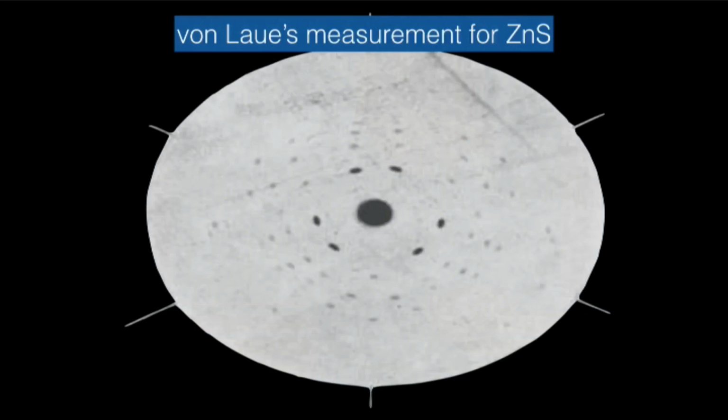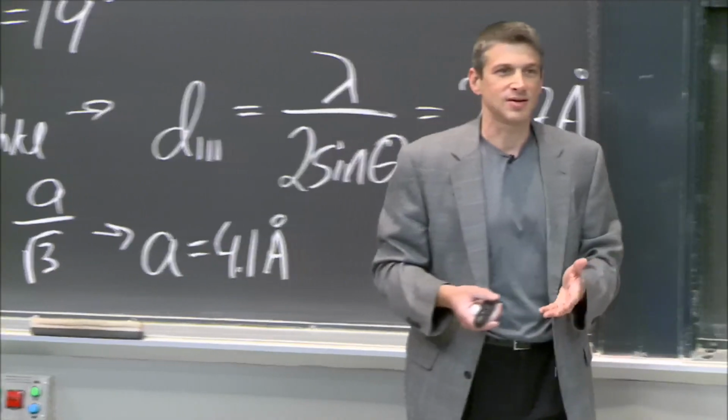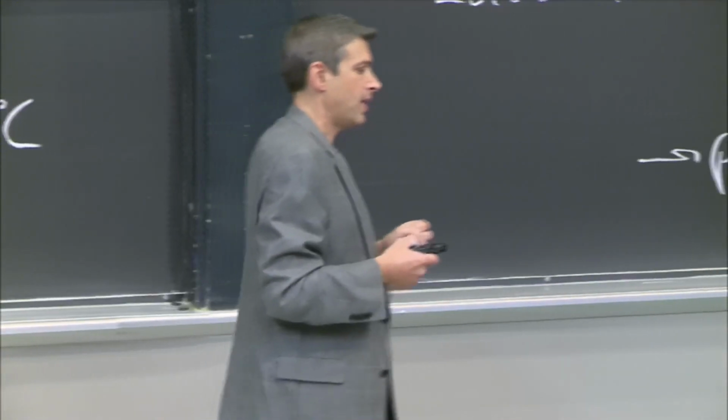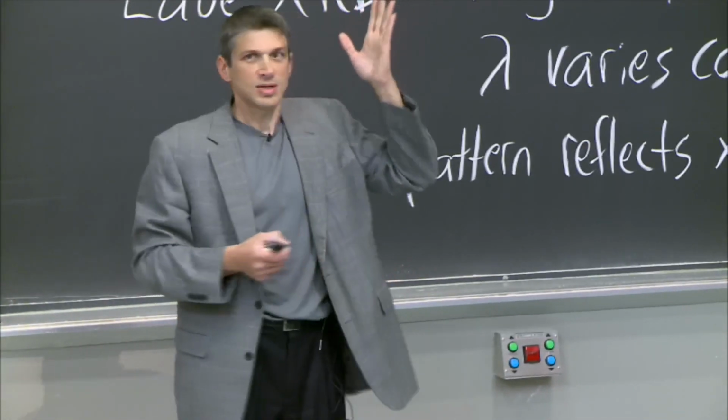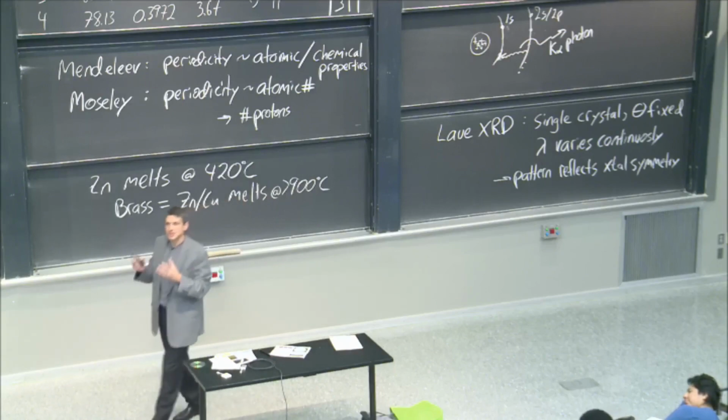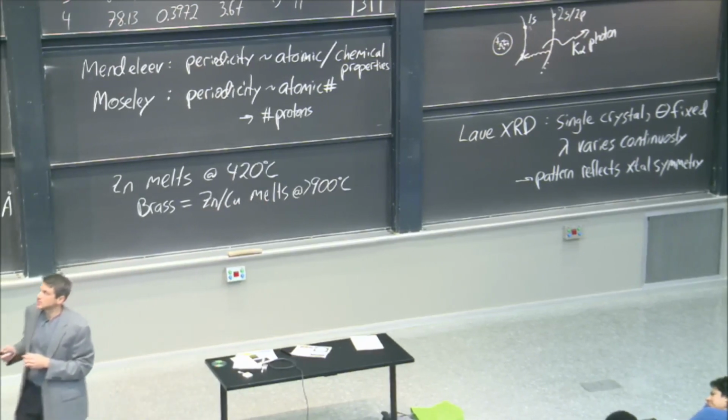Look at that pattern there. The thing that you could get is the symmetry. Oh, by the way, I'm not going to test you on Laue. I'm only talking about it for 5 minutes here, right? So in this class, I want you to know about using characteristic peaks and all the things we've been talking about. Laue is just on the side for knowledge. We won't test on this.